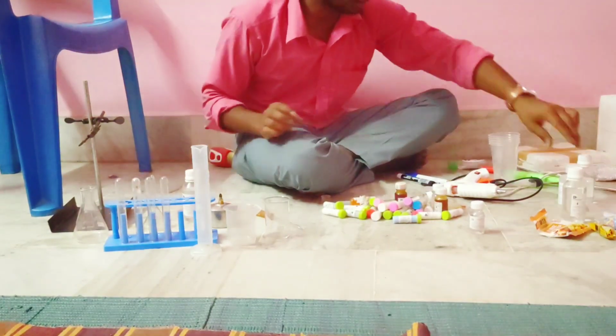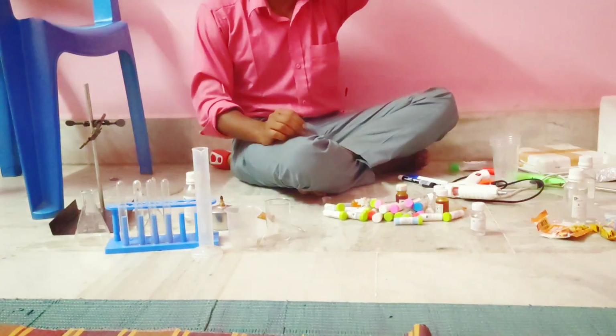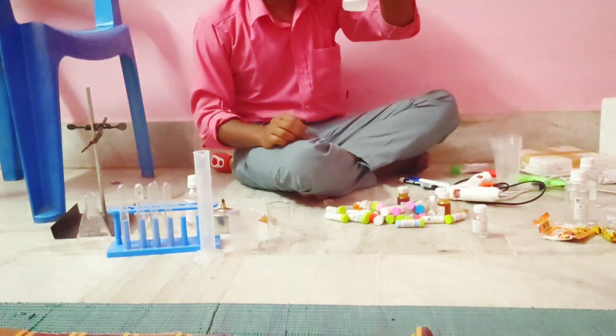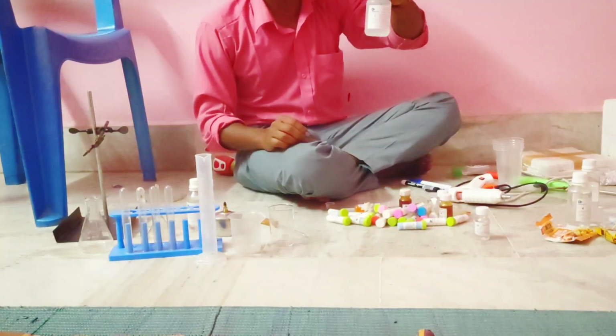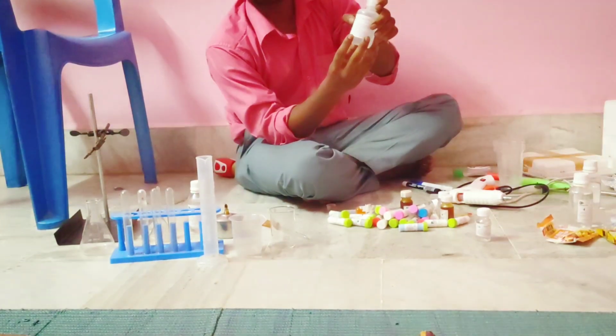Okay. Now if we talk about this one, that is called sodium hydroxide solution, and it is also diluted. I have the things which are diluted. They will not provide me concentrated because they are dangerous, and I could use them for any purposes. So I have to make a license if I want to get the concentrated product. They will not give me anything. So that's why I have only the diluted product.